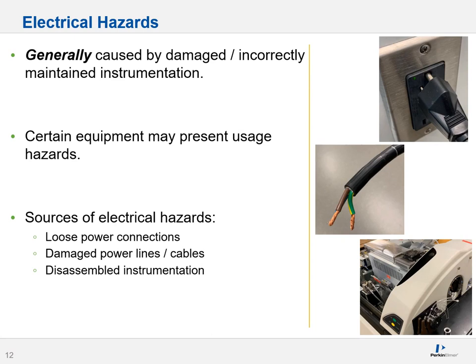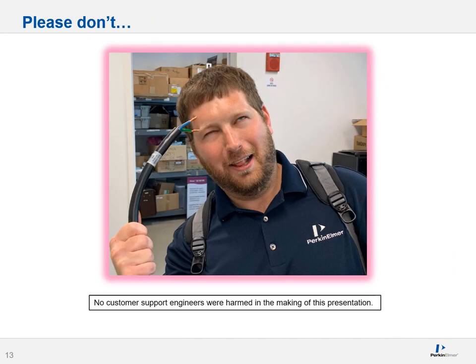Electrical hazards are generally caused by damaged or incorrectly installed or maintained instrumentation. In modern labs with modern equipment, electrical hazards aren't statistically all that common as long as instrumentation is used per the manufacturer's specifications. That being said, certain equipment may present usage hazards, such as anything with electrodes. Other sources of electrical hazards include loose or frayed power connections, damaged power lines and cables, and disassembled instrumentation being repaired. If you ever see a lockout/tagout tag, respect it. Don't bypass any locks or maintenance items your engineers have installed.